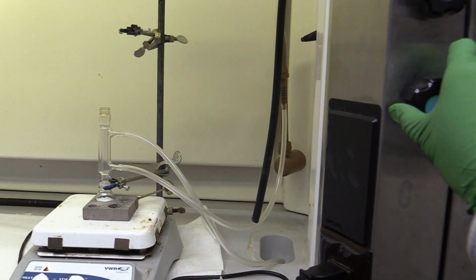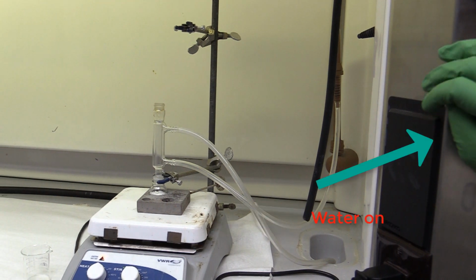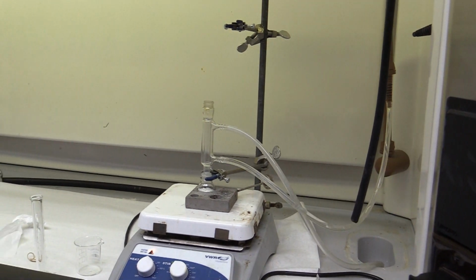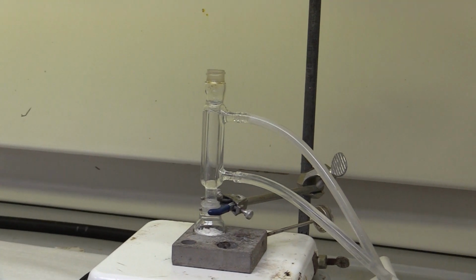Begin heating and stirring. The mixture may not stir right away, and that is okay. Turn the water on just enough for water to exit out the top and make sure it drains. The water flow does not need to be high, it just needs to have enough where it goes in the bottom and out the top.